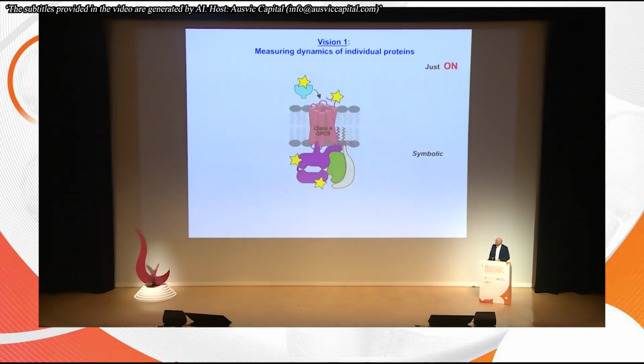Now the importance comes out instantly, because if you have on-off, then it means that you cannot see this molecule when the other one is emitting, and vice versa. But in this case, of course, you can trace all the molecules constantly without any interruption, and you don't have to use a blue and a green and a yellow one to separate them. You can separate them and still see them moving. And that means that you can take movies, so to speak, of constantly moving emitters all the time.